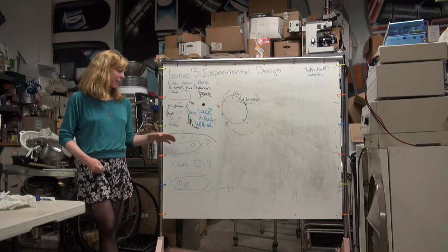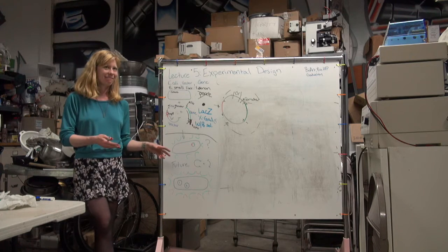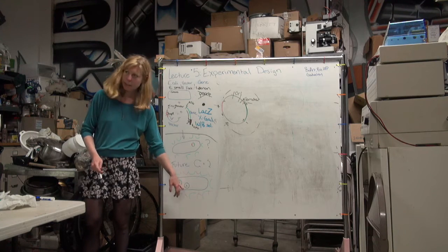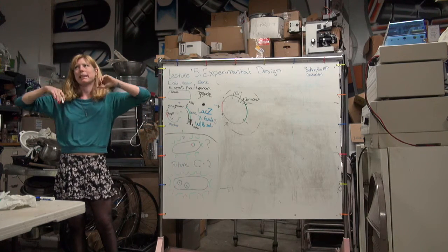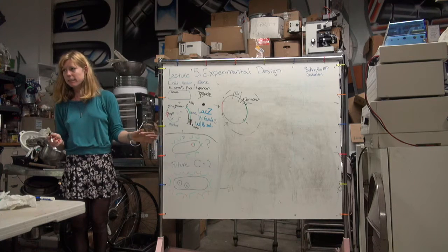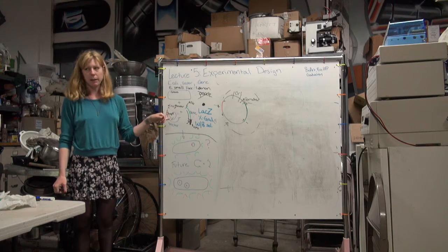I would recommend having an additional differential marker if you're going to be adding more than one gene, because it's going to be hard to determine. If we were moving along to adding our second construct to have the full two genes that we need to make a lemon smell, we'd only have to have one difference in this process, and that would be choosing a different resistance marker.